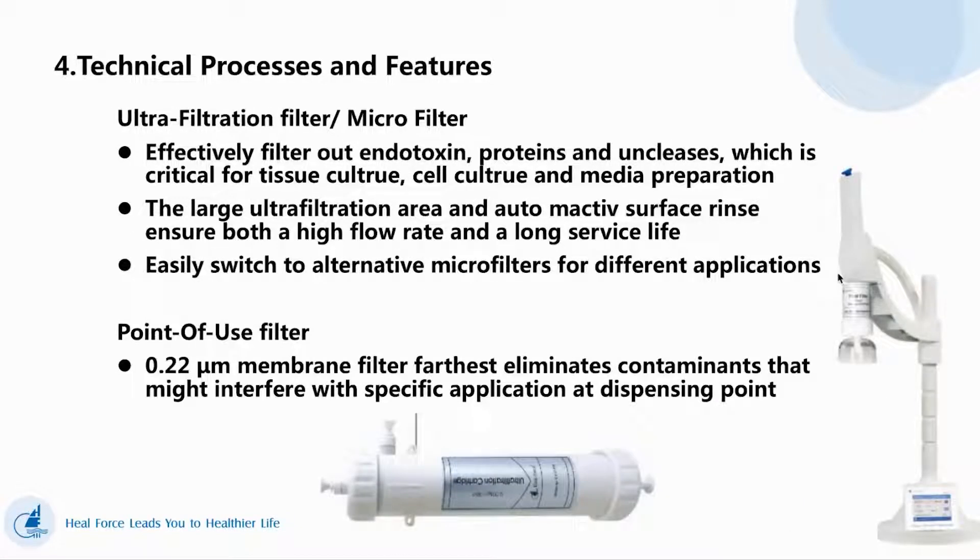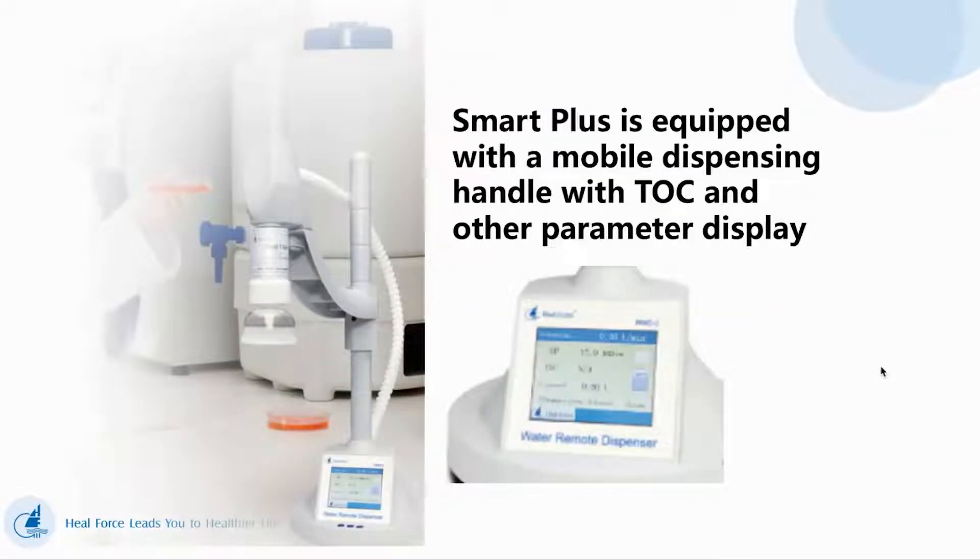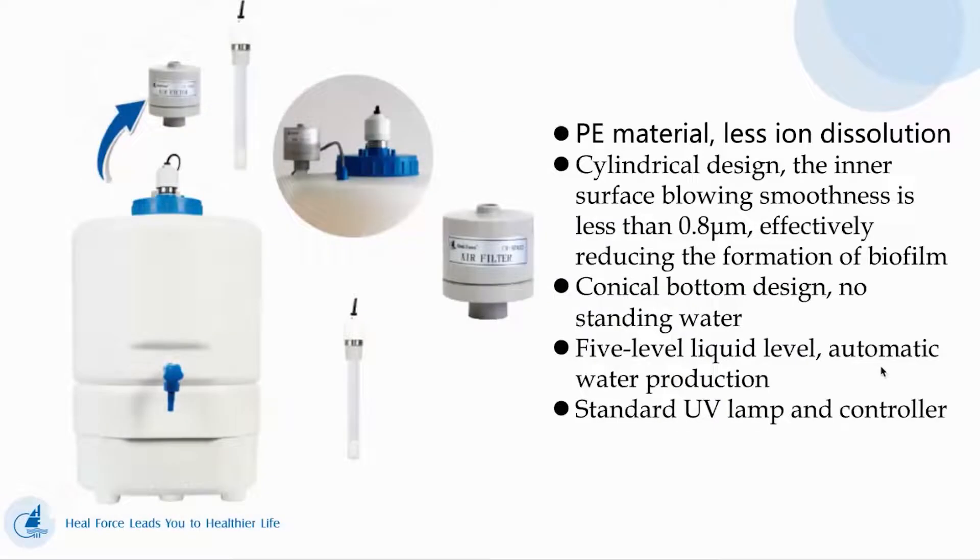This is our ultra-filtration filter or micro filter. This is our point-of-use filter or final filter. This is our Smart Plus TOC monitor and display function. Smart Plus has a mobile dispenser with TOC and other parameter display. We also have an air filter and UV lamp inside the water tank.